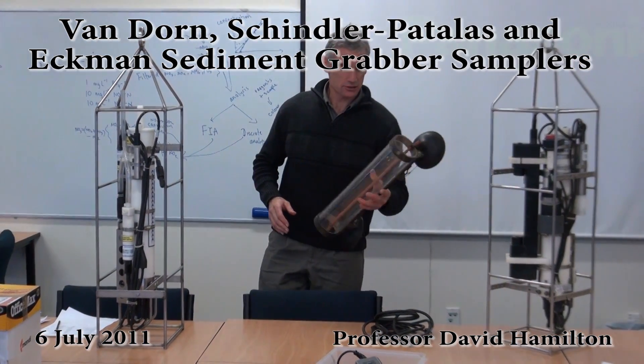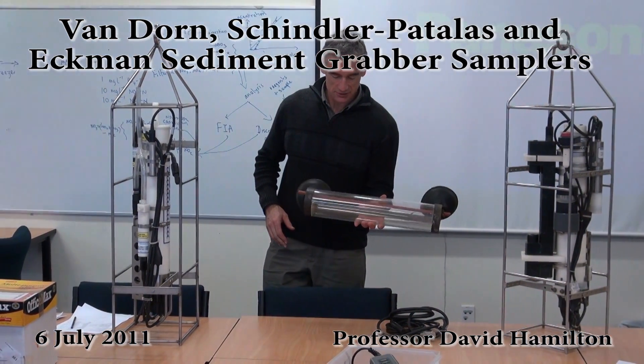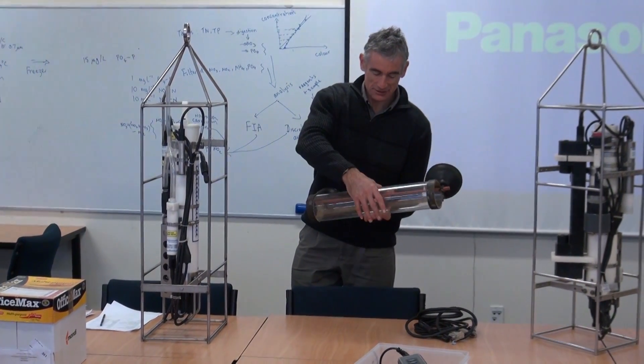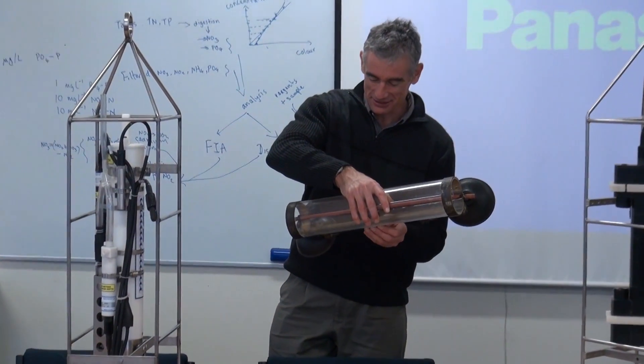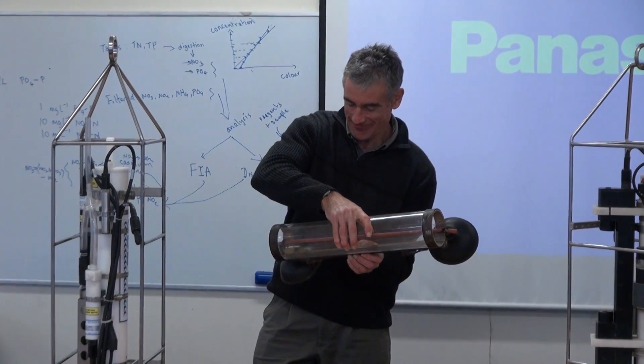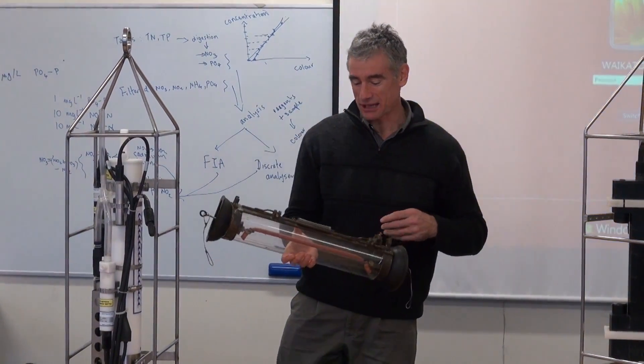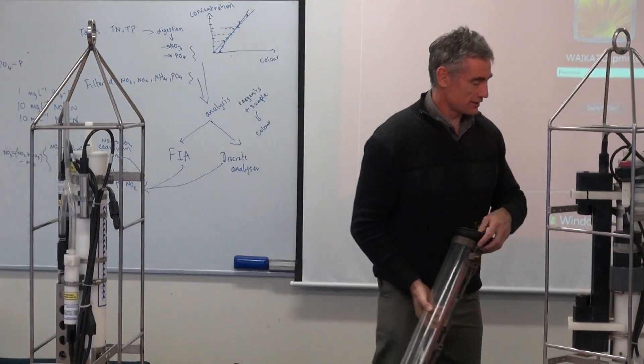So the Van Doorn Sampler, it's a real dog of a thing. I'm going to, at the risk of losing a hand here, I'm trying. That's what happens, there's a messenger that gets sent down.